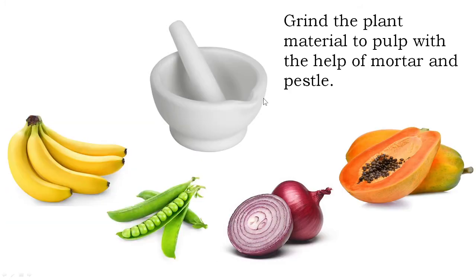In the second step, you need to grind the plant material from which we want to extract the DNA. You grind the plant material to a pulp with the help of mortar and pestle. For example, if you are extracting DNA from banana, you cut the banana into small pieces and grind it into a pulp.